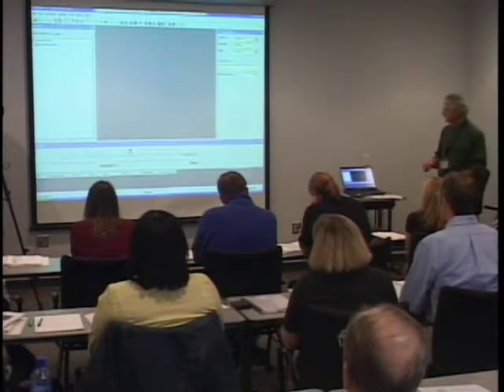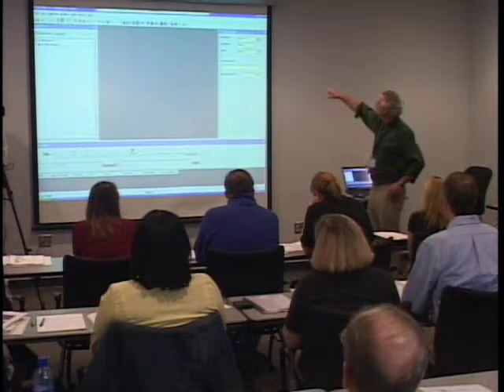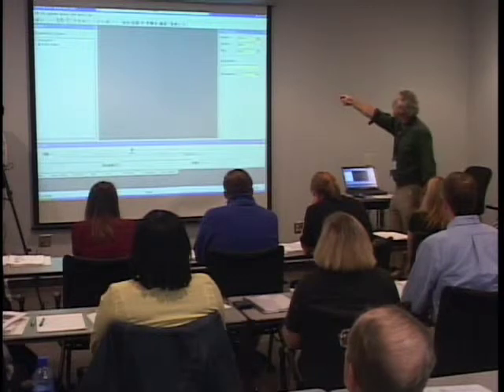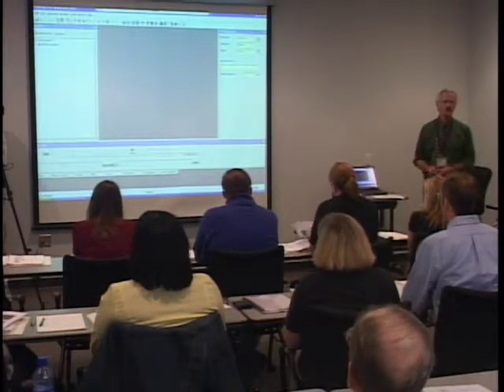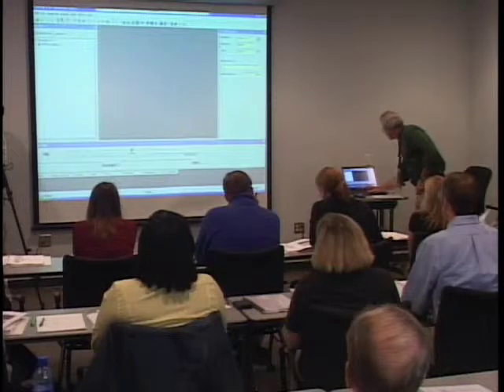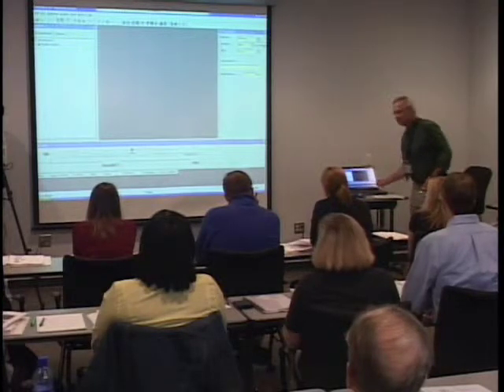This comes up and there are two pages. This is the Mass Center main page. This is really just a point of reference — the main thing you want to use this page for is getting to the instrument warm-up button up here. This will take you to the tuning page. The other thing is the stop button, which is grayed out right now because we're not actually measuring anything. I'm going to turn on the instrument tune page — you can get here by going to the little icon or the instrument tune manager menu button.